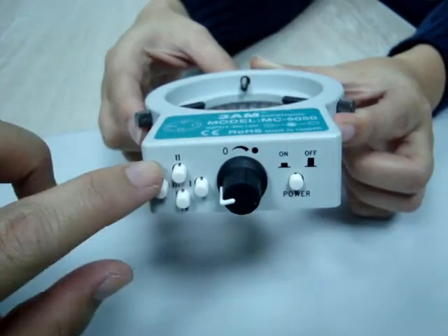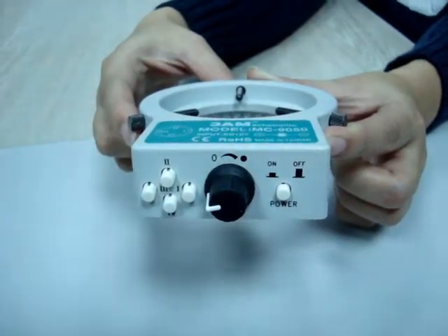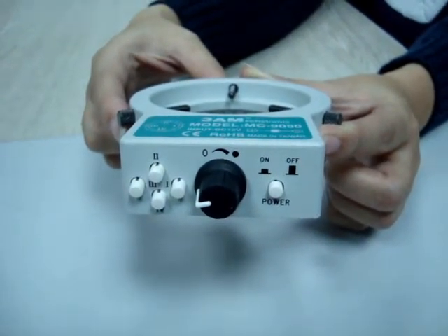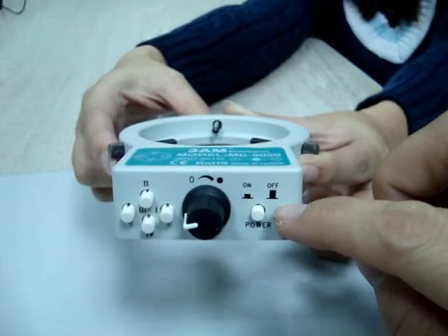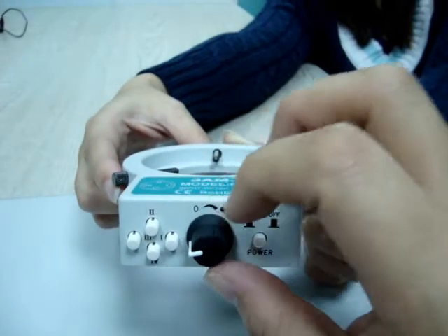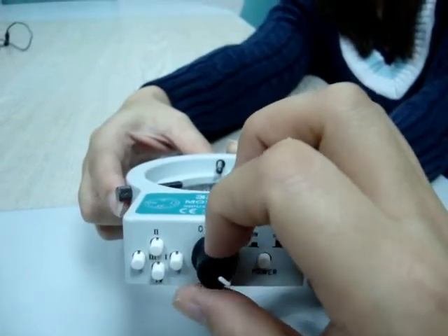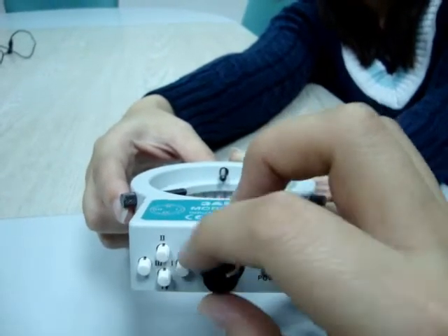We have four individual buttons here which you can control the lighting area individually. With the on and off button here you can switch it on and switch it off easily. And with this button here you can adjust the intensity of the light easily.